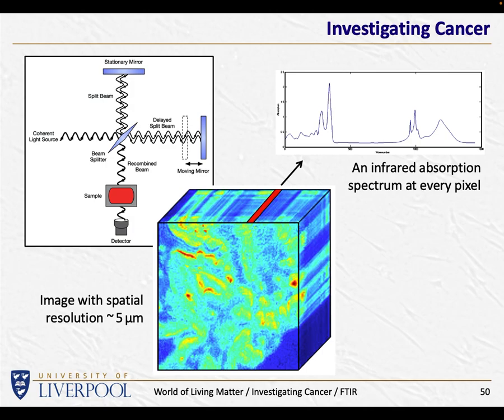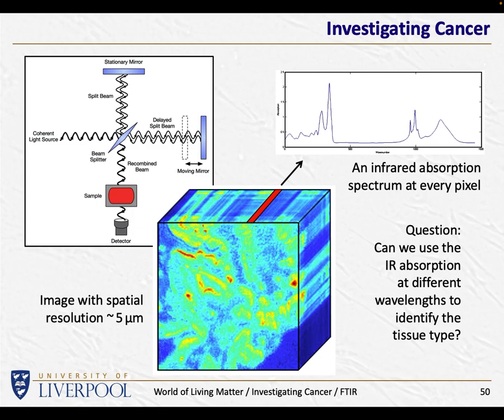The catch is healthy tissue and cancerous tissue look very, very similar. In other words, you might say there are enormous changes here. Well, true, but you'll see exactly the same for healthy tissue as tissue that's going to become cancerous. The differences are tiny. You won't see them simply by plotting out the spectra. We need to apply certain computer algorithms. That's what our PhD students are working on. How are we going to analyze these spectra to show us which wavelengths are important?